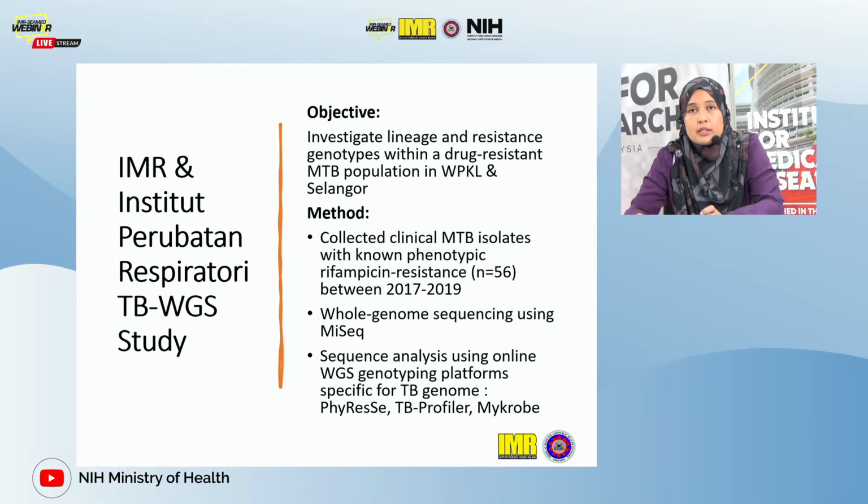We used the MiSeq sequencer from Illumina, and sequence analysis was done using online whole genome sequencing genotyping platforms specific for the TB genome, namely PhyResSE, TB-Profiler, and Mykrobe. These are available freely online. Very good and very user-friendly, especially for non-bioinformaticians.